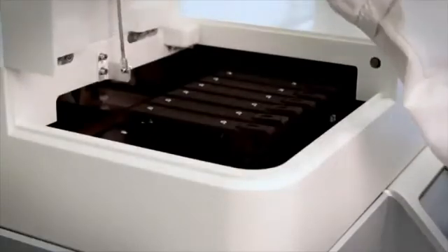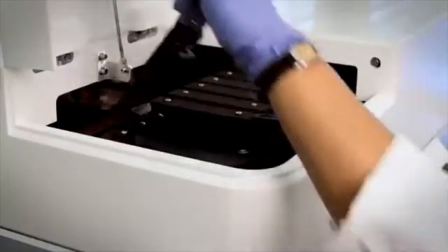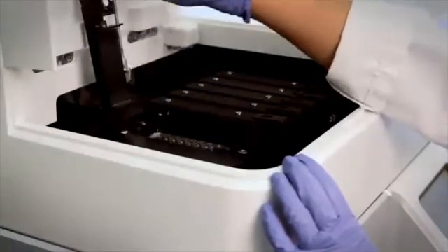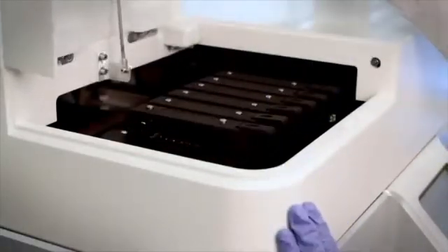Then, clip the cartridge securely into the stage position for which you've entered information. Make sure that you feel tension from the springs in both the X and the Y positions, meaning that the slide is firmly held in place by the cartridge holder.